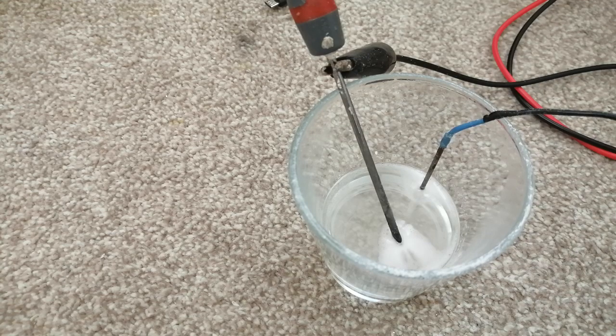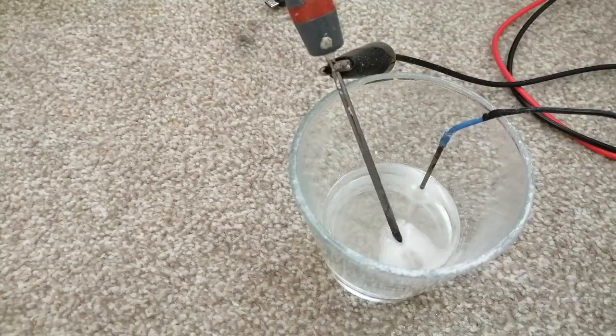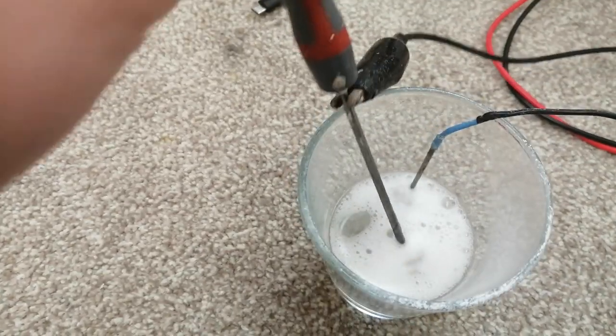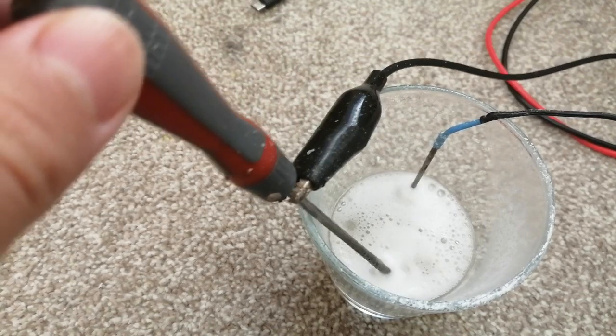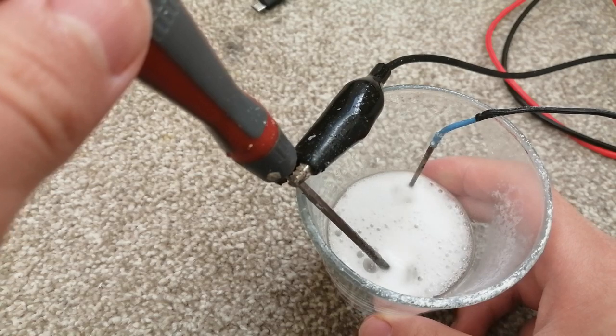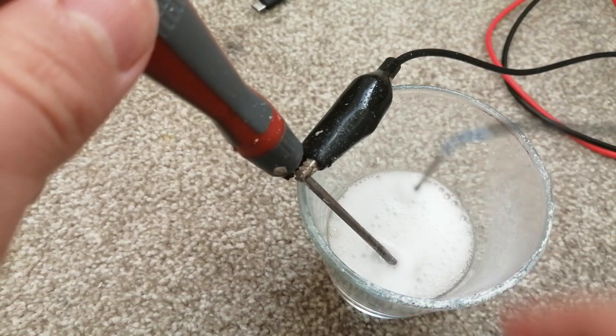We're going to test the solution to make sure it is sodium hydroxide solution. The longer the distance between the electrodes, the higher the resistance will be. The more energy you put in goes into heat instead of splitting the water molecules.